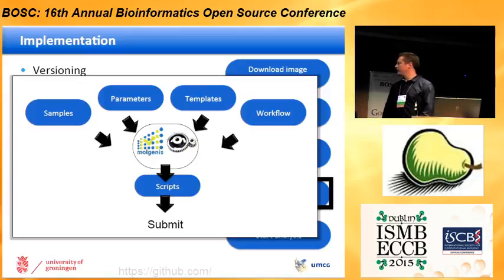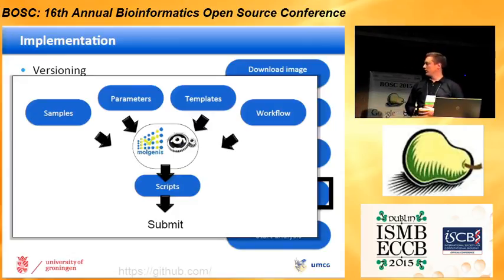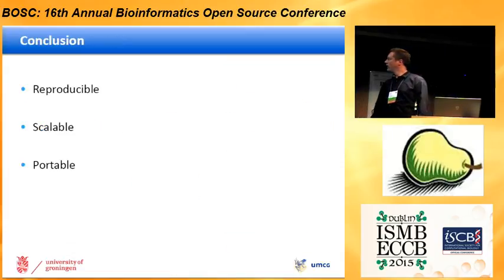And with a push of the button, the software then generates these scripts. And these scripts can be run inside the VM using the Slurm scheduler or just sequentially. And within the framework we also have support for BSUB, PBS and other schedulers.